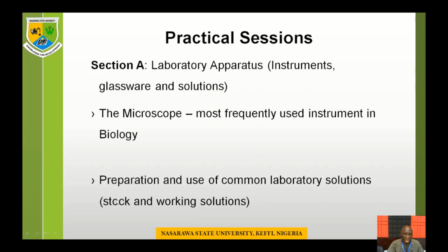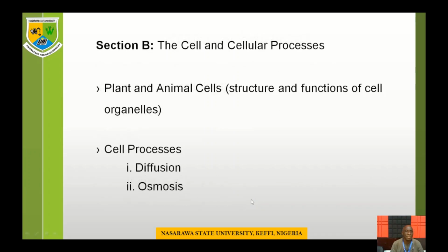And from this one, we can prepare the second one that is called a working solution. So we can get a working solution prepared out of a stock solution. And the working solution, we use it over a small period of time, and even if it remains, we discard it and go back to the stock solution to make another working solution. We'll be looking at all that.